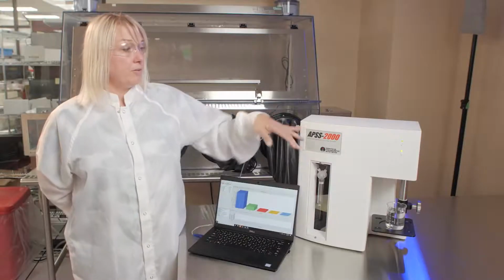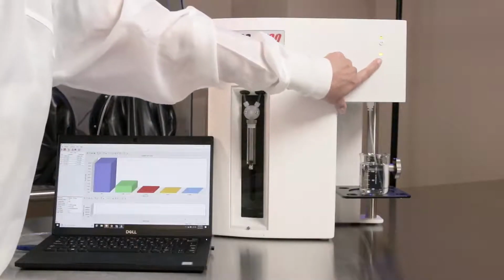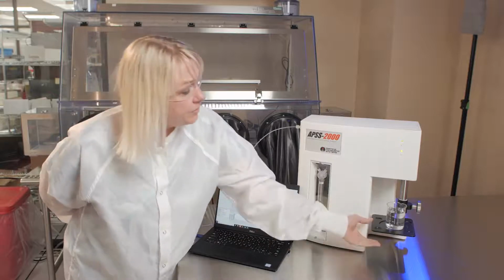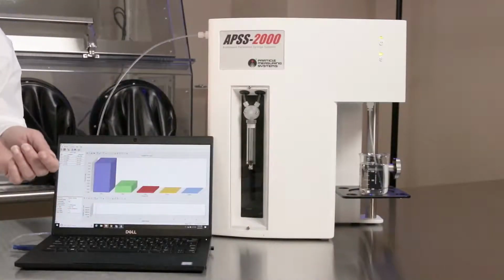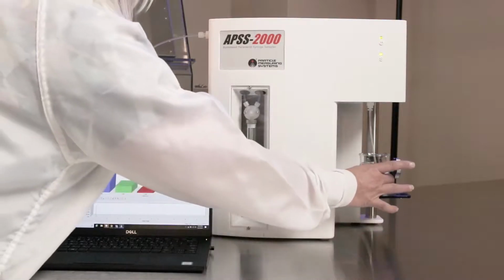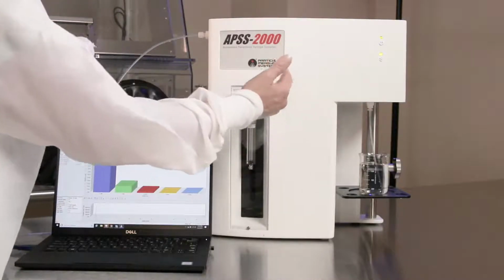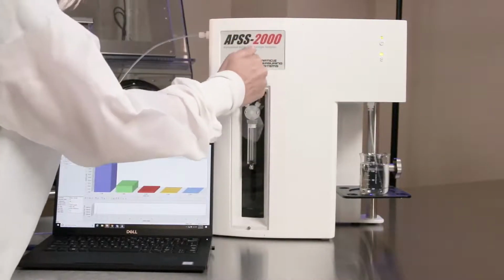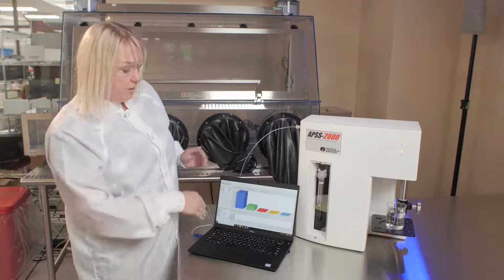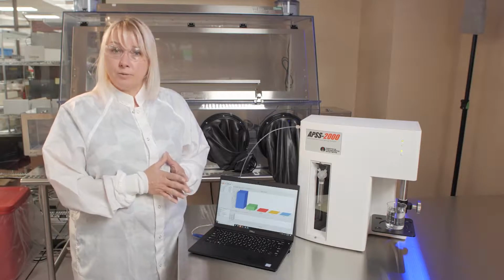So with the APSS 2000, we have a power button, we have a status button. When this is green, the instrument is ready. And this over here is the stand. This is an adjustable stand. This goes up and down to meet your sample. Your sample is placed here. Sample goes through the syringe, up into the sampler, down through this pump, and then out the instrument. Meanwhile, the software is recording all of the data related to non-viable particles.